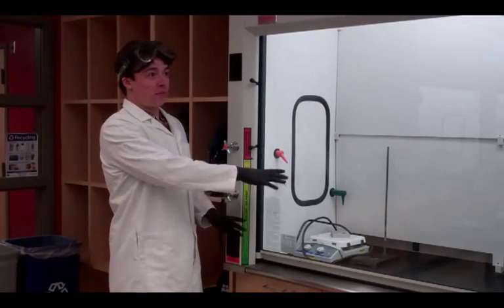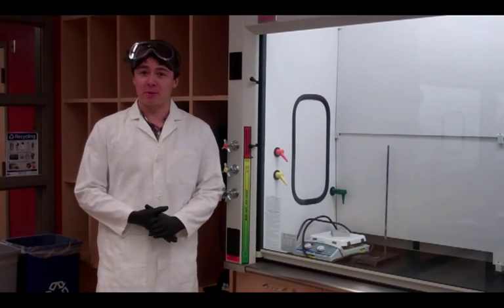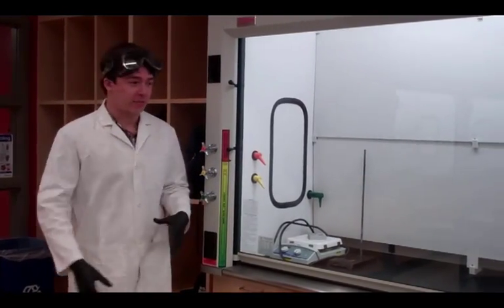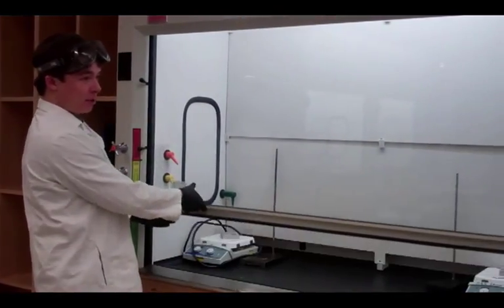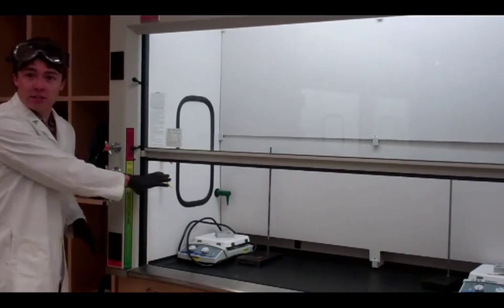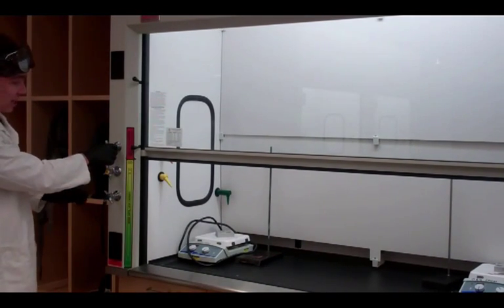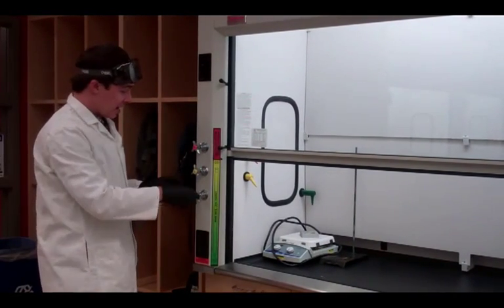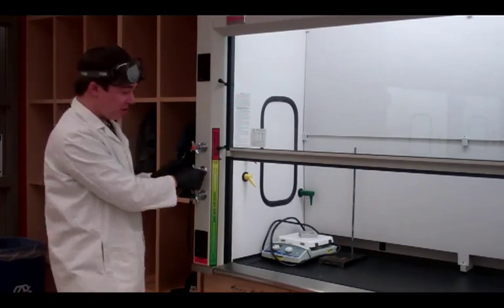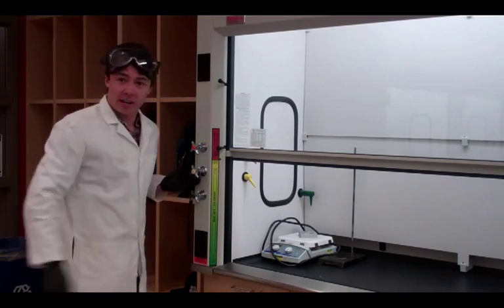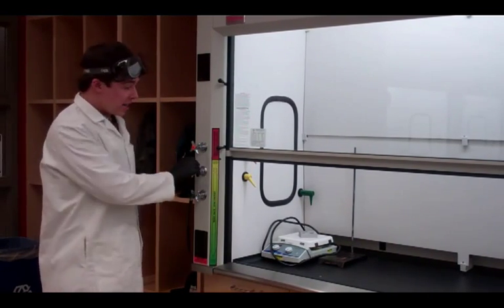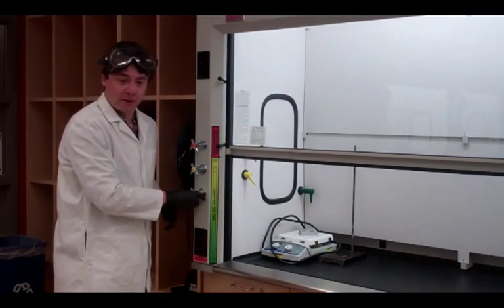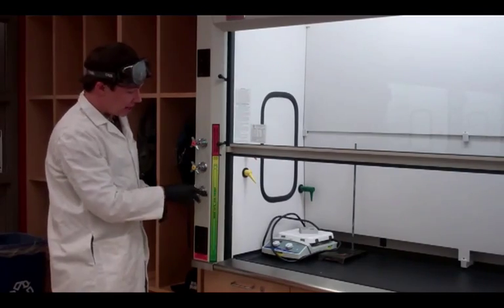So these are our fume hoods. This is for all of the toxic chemicals that we work with so we don't inhale any of the fumes and get any bad side effects from it. This lifts up here so we do our work. We have a couple different nozzles under here that we work with. This one is air. Mostly just use that to dry things out. This is going to be our vacuum, and we'll show you that in a little bit for our vacuum filtration. And then we also have a water spout down there in the back.